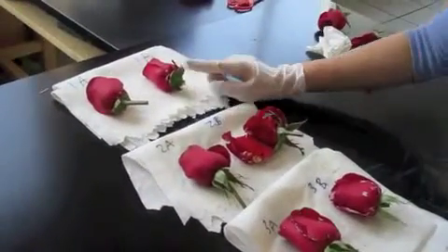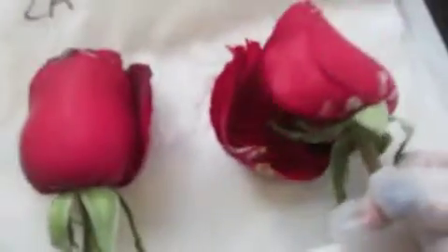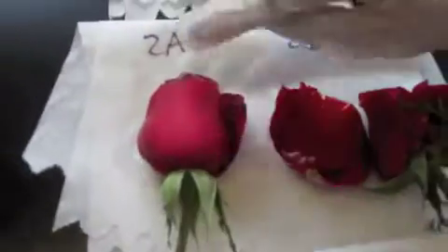Roses after 1 minute, after 5 minutes, after 20 minutes. If we look at the ones from 1 minute, we can see that really there was not a lot of change. As we go down, we can see that this one has actually fallen apart, which means it reacted more, and there's more white visible, meaning more color has been taken out compared to the one that was only in for 1 minute. This one has more black stains and white stains compared to the one before.